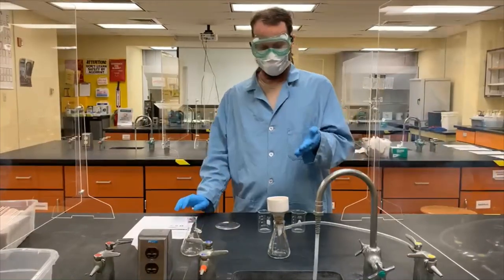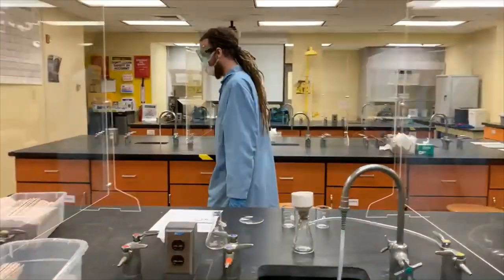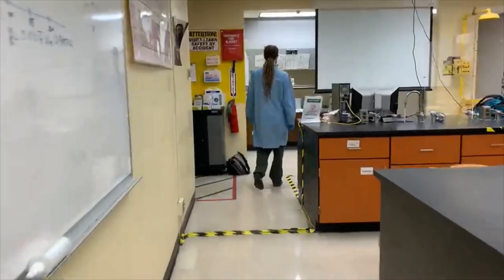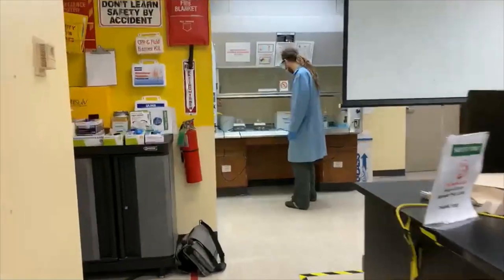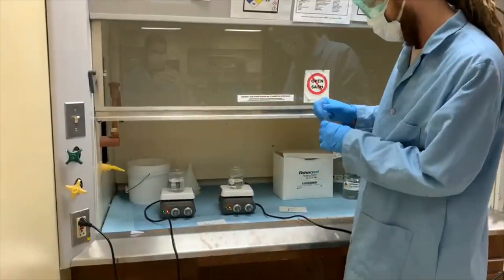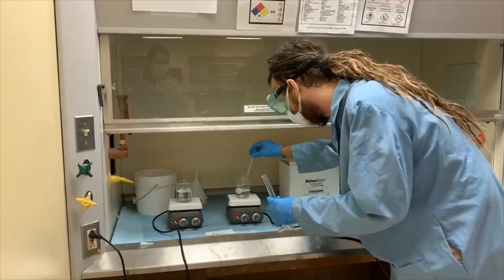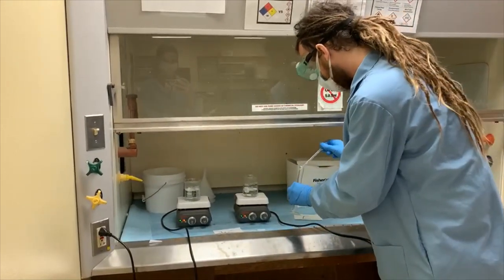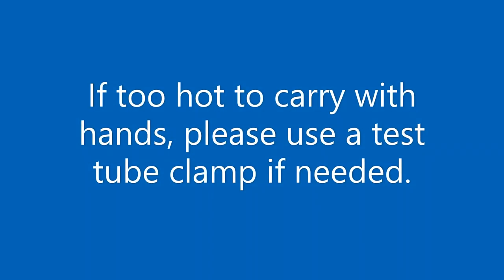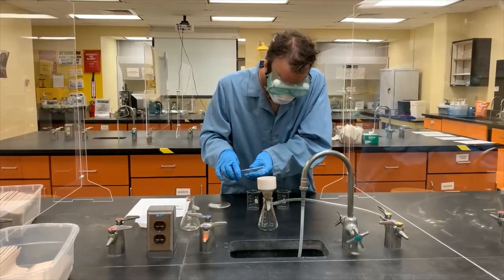we're going to want to dissolve the salicylic acid using some hot ethanol. So we're going to go over to the fume hood where we have the ethanol heating up. And we're going to want to use a pipette and a graduated cylinder to measure out about 20 milliliters of warm ethanol here. So we're going to slowly pour it into our little filter flask here.